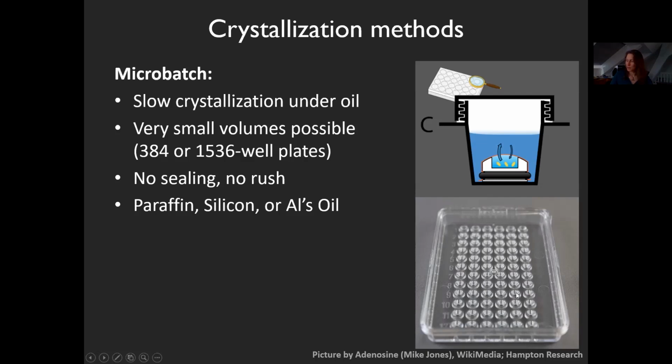So down here, in the wells, you have your drop and it's covered in oil. So you basically cover the entire plate in oil. You pipet into each of those holes some oil. It can be silicon oil that can be pipetted, or paraffin oil, whatever you like. And then you pipette your protein solution, already readily mixed, on top of it, and the drop sinks to the bottom and is then covered by the oil.